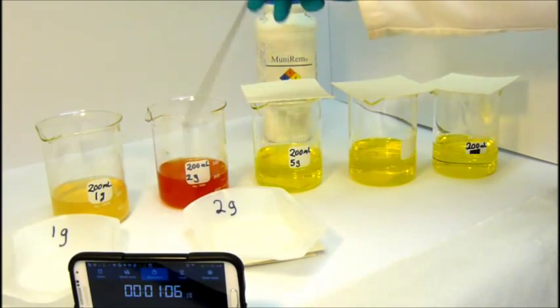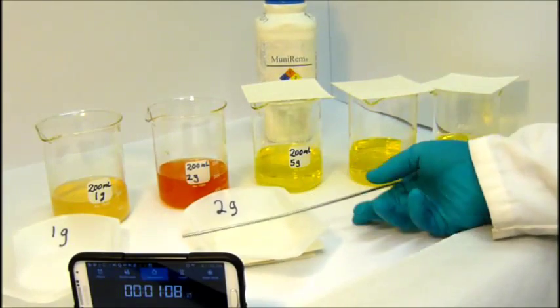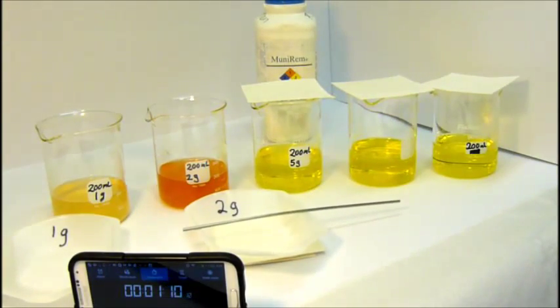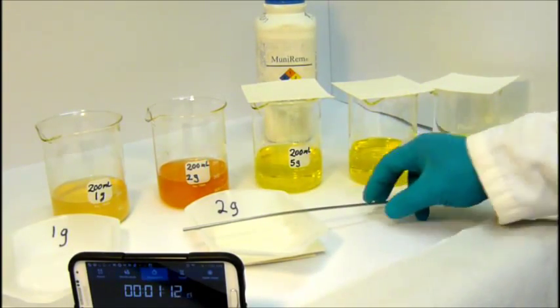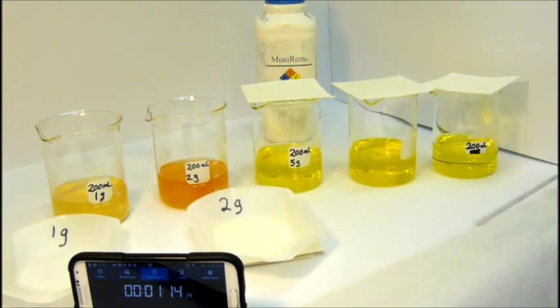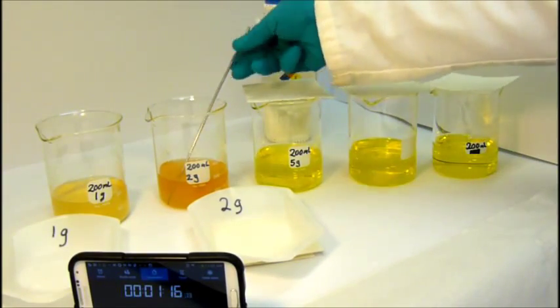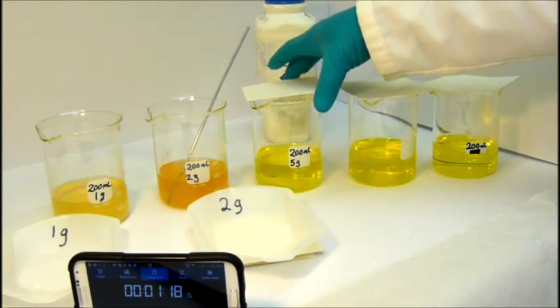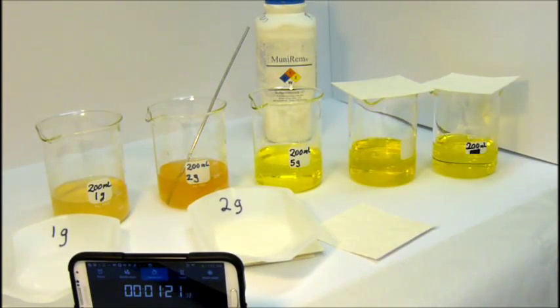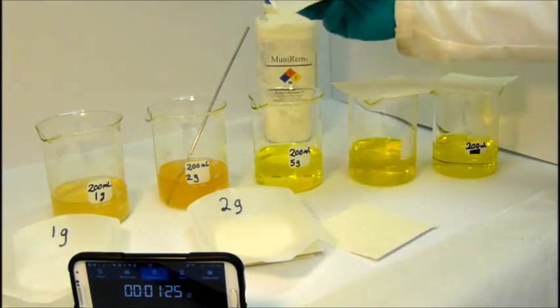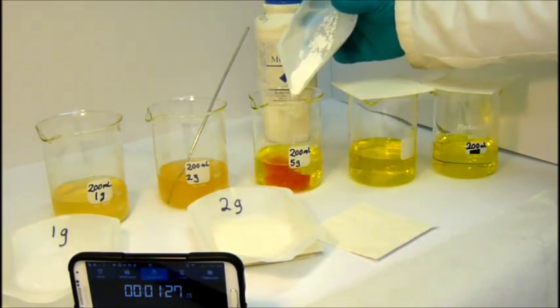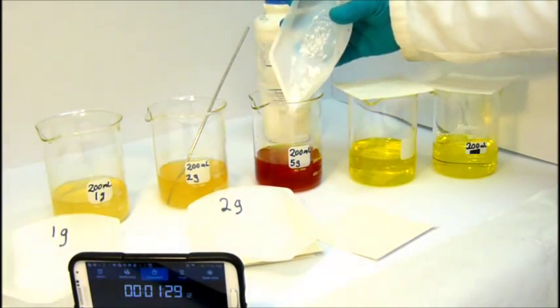Although this test shows Munarem's effectiveness from a visual viewpoint, you will find on our website a study with full test data where EPA method 8330 was used to confirm Munarem's effectiveness. EPA methods were used to confirm that the resulting solution had non-detectable levels of the original explosive and contained nothing that would prevent the classification of the wastewater as non-hazardous.